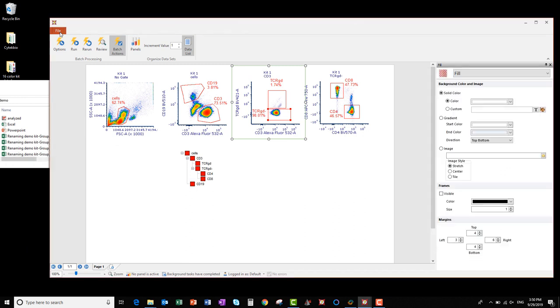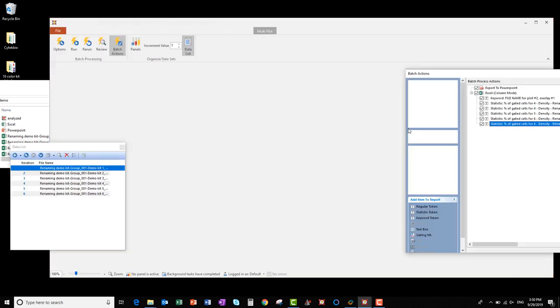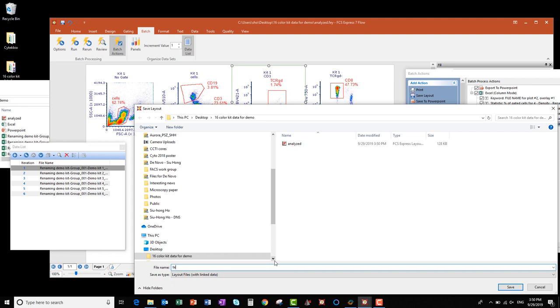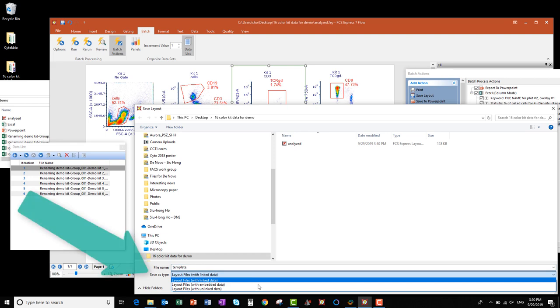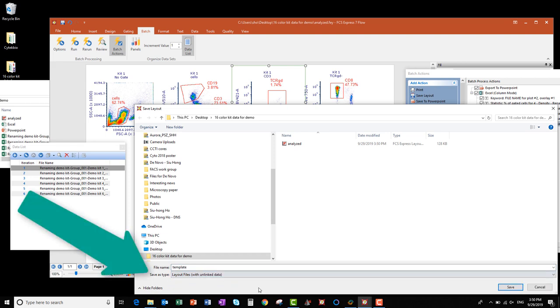I'm also going to save it without the links. So again, go to File, Save As, enter a file name — this one I'll call Template — and for Save As Type, select Layout Files with Unlinked Data, and click Save.